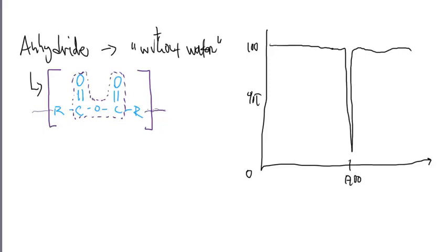And we said these are very strong peaks and very narrow peaks, but sometimes they're broad too, so we don't really define it that way, but very often they're narrow. And like the NO2 group, this has two carbonyls. NO2 had two oxygens. And what we see with an anhydride is a very similar shape to a nitro group.